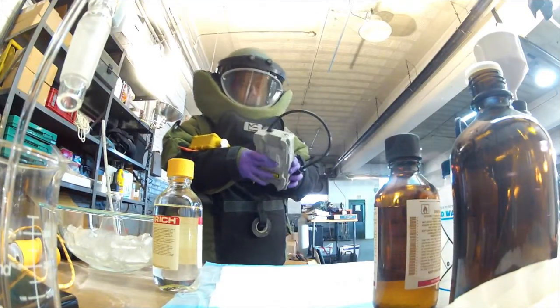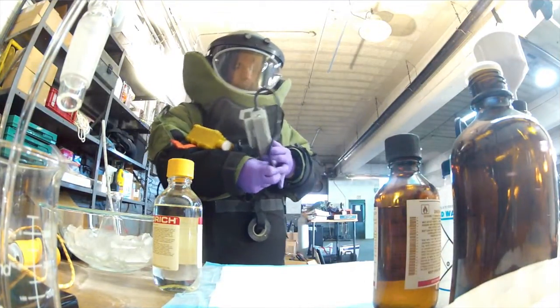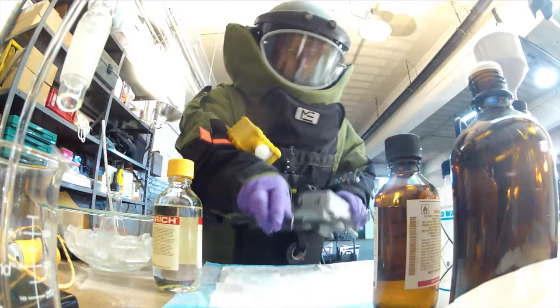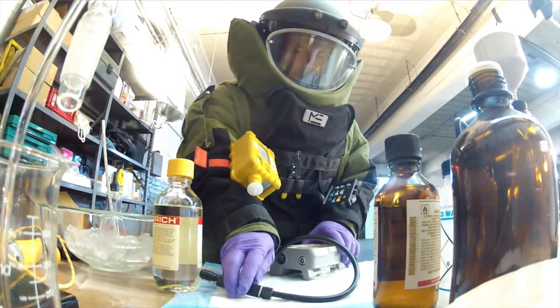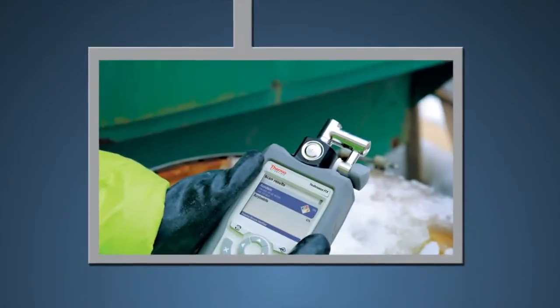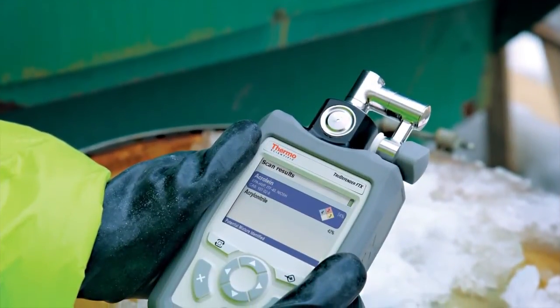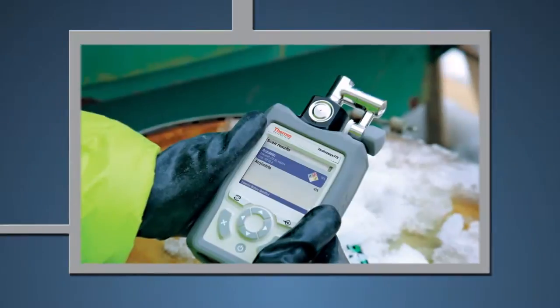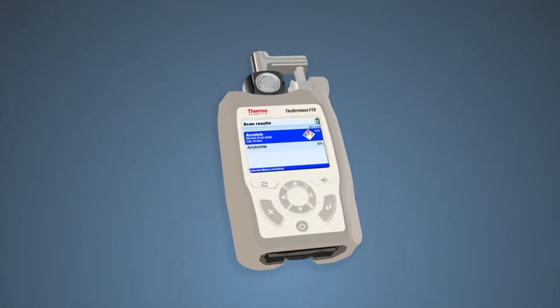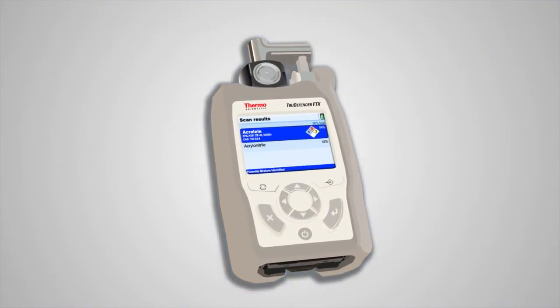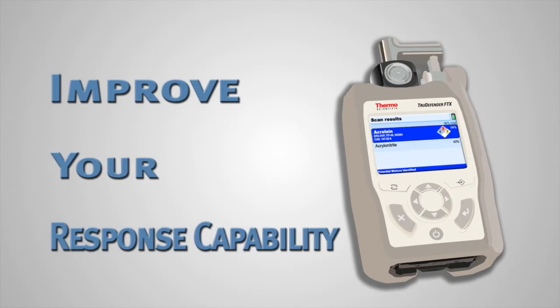Building on our award-winning suite of chemical identification tools, TrueDefender FTX incorporates extensive user input based on thousands of instruments fielded worldwide. We've applied innovative engineering and the latest thinking in industrial design to create a product tailored to meet the needs of our users. Learn more about how TrueDefender FTX can help improve your response capability.